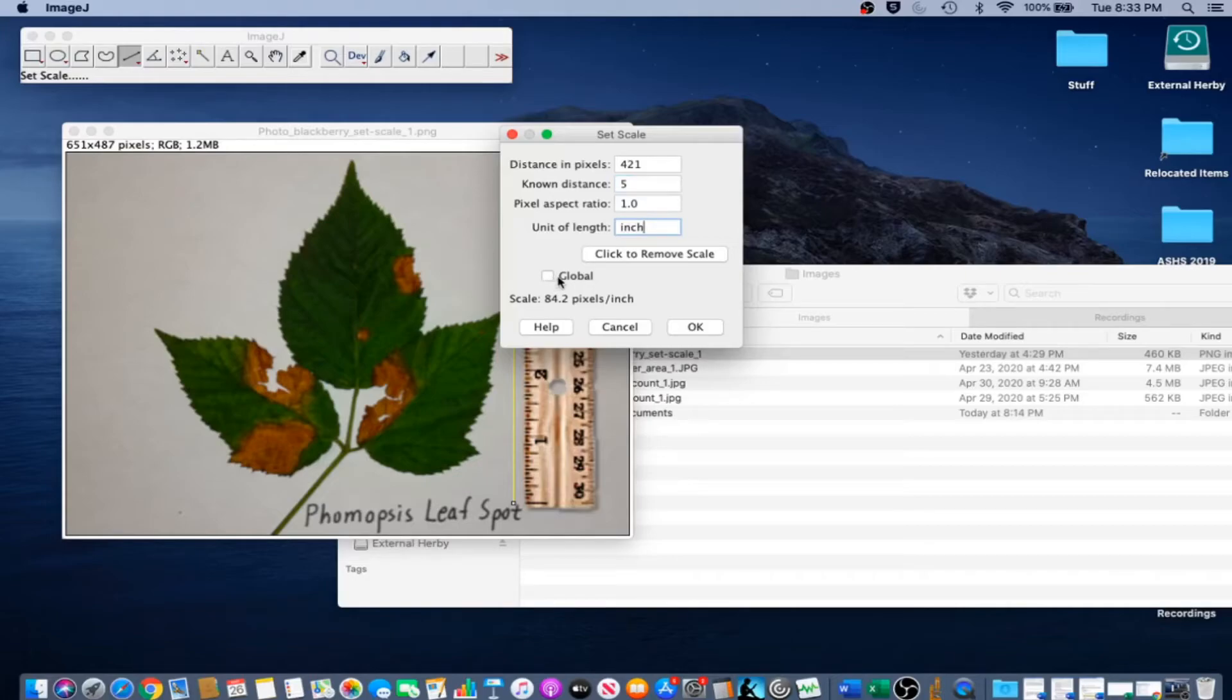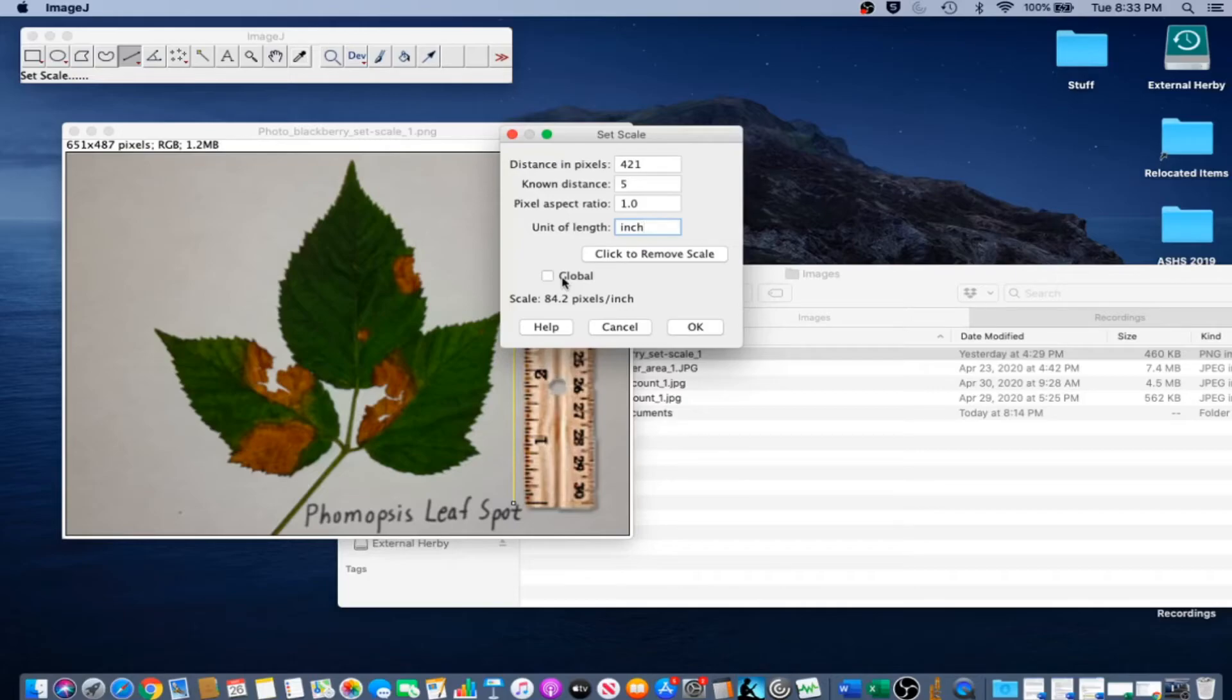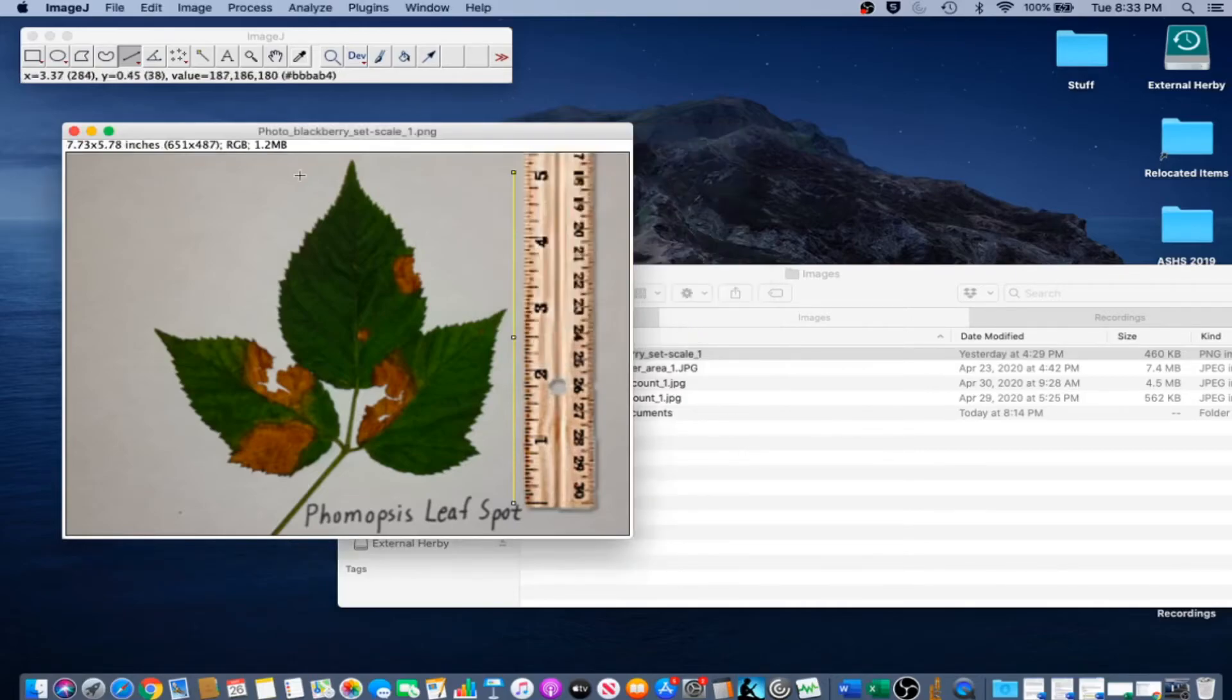When the global option is checked, the same scale will be applied to all images opened after this, until ImageJ is quit or a new scale is set. This can be useful if a whole set of images were taken at the same scale. Go ahead and click OK.